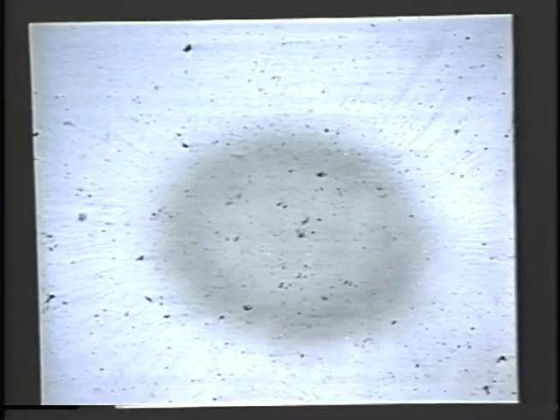Those of you who have done sectioning have noticed some of the artifacts created as a result of different embedments that we use. Jim Kramer, Eileen O'Toole, and George Ray at the HVEM facility in Boulder have done a study on beam-induced artifacts in embedments. Here is an example of beam damage to an embedment, and you can see stretch marks around the region where the beam was projected onto the embedment.